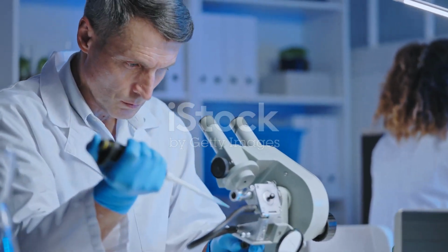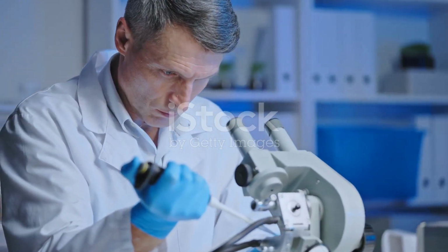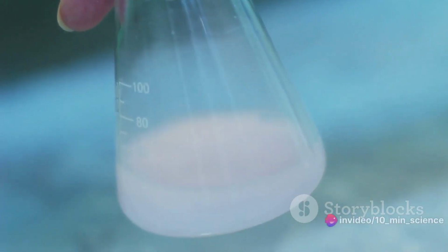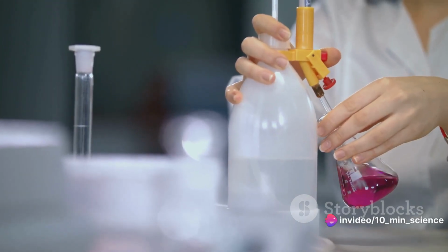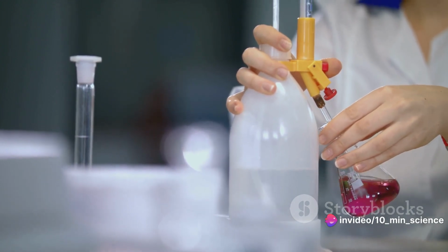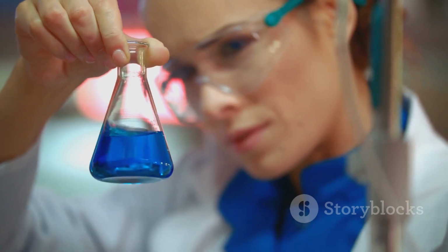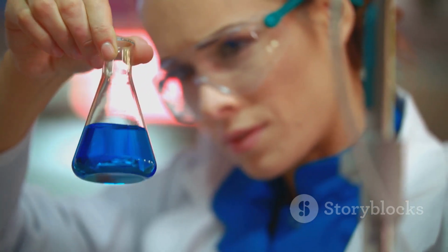Chromatography, in essence, is a game of hide and seek at a molecular level. The mixture to be separated is introduced into a system, and each component interacts differently with the system, causing them to separate at different rates. This separation allows scientists to identify and quantify the individual components.